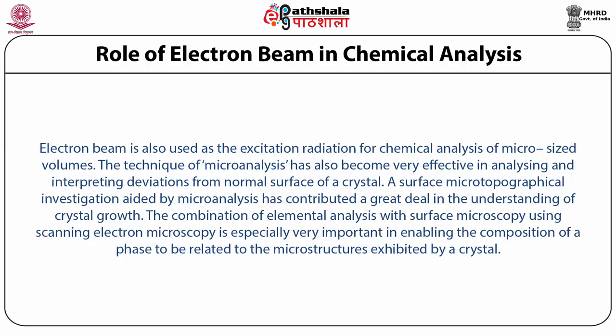The technique of microanalysis has also become very effective in analyzing and interpreting deviations from the normal surface of a crystal. A surface microtopographical investigation aided by microanalysis has contributed a great deal in the understanding of crystal growth.